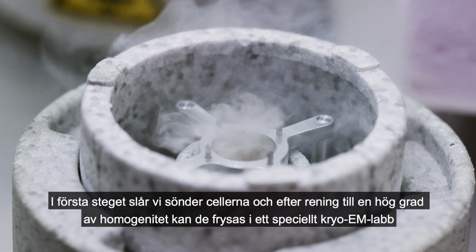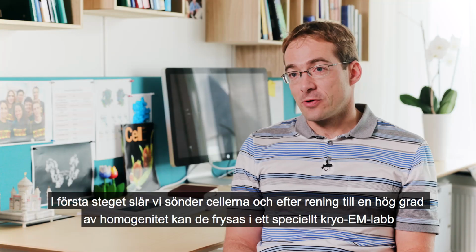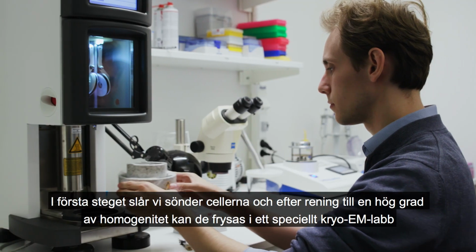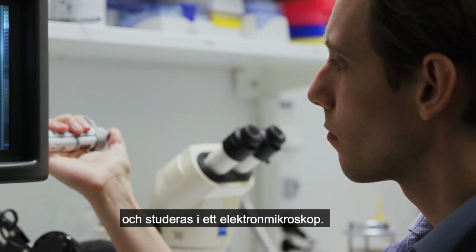The first step, we break the cells, and once they are purified to a high degree of homogeneity, then they can be frozen in a dedicated cryo-EM lab and subjected to the electron microscope.